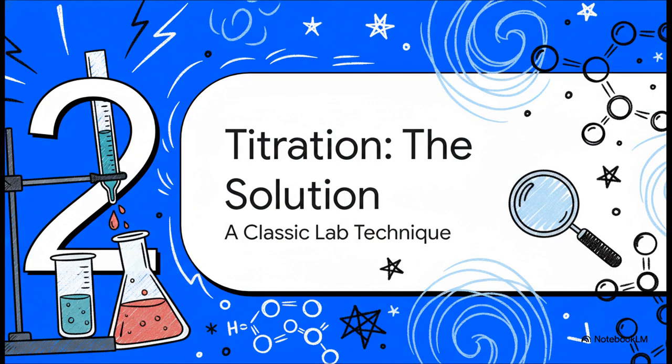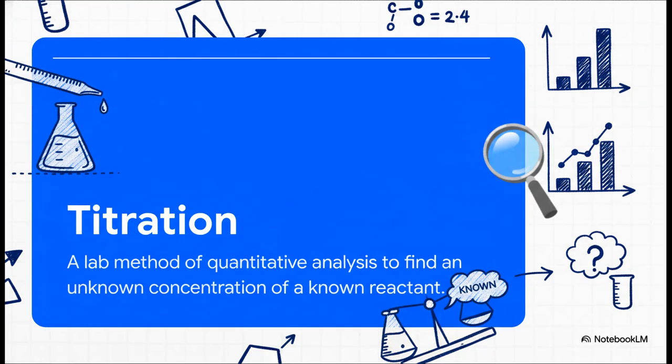Well, this is where our hero of the day swoops in. The solution to this chemical mystery is a really elegant, super precise process called titration. And trust me, it's a cornerstone of chemistry labs for a very, very good reason. So let's look at what that actually means.